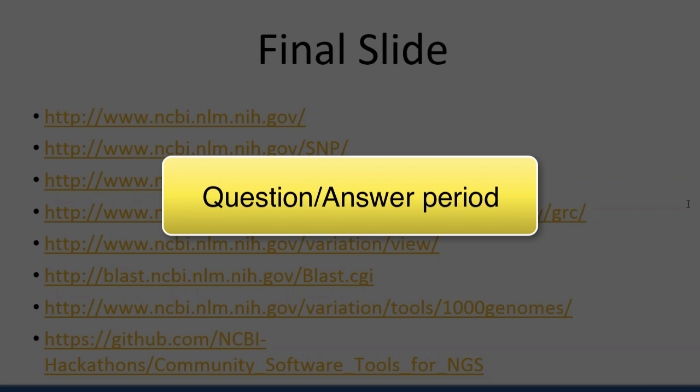Somebody asked about the program Gemini. That's potentially something we can add to a future webinar. Somebody else asked about ANNOVAR's version of RefSeq and whether it's directly from NCBI or whether they modified it in any way. I don't think it's modified, but we will double check and we can get back to you on that.